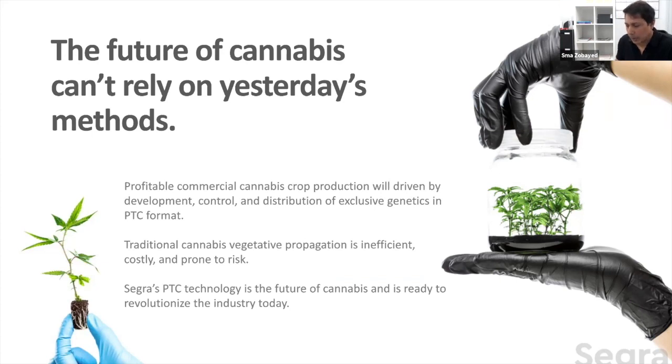When everything is clean and certified, we put it in stage 3. In that case, we have a 3.5 vessel, and we do every vessel. One vessel usually has almost 100 plants or 90 plants. So we do one sample test for each of these vessels and see if any DNA change is happening. If any of these shows any kind of abnormality, we don't send the whole batch. Usually we stop, investigate further, and go back and test each plant.